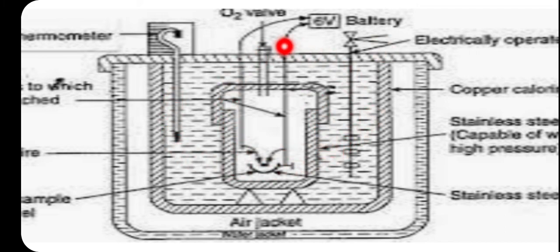After this, through this oxygen valve, oxygen is added. Now when oxygen is added into it, a spark is generated using this battery. So when the spark comes, using the spark and the pure oxygen, these magnesium wires start burning.